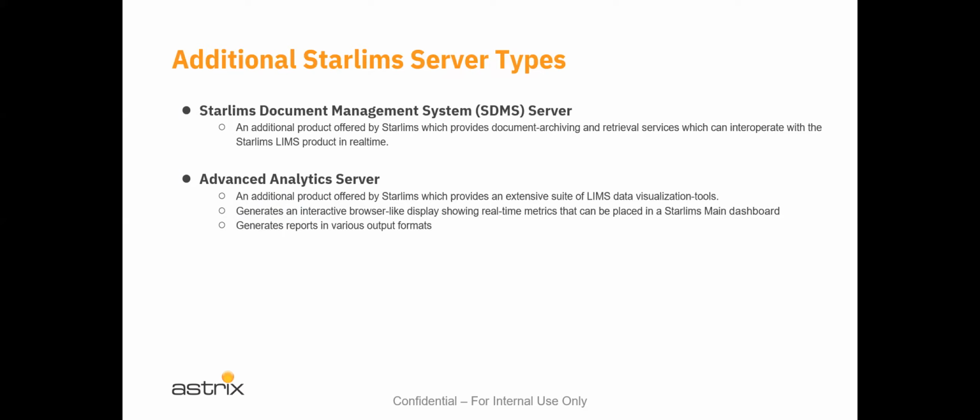And so the SDMS system accommodates the need to store PDFs, for example, that are generated by instruments. They're also able to store anything related to technician certifications. You've got to have a certification to use a specific instrument, and if that certification expires, it also allows for multiple instances of someone having been previously certified to continue their certification process, and it stores all of that documentation. So they decided to keep that outside of the application server itself for STARLIMS. It's got its own world, SDMS server.